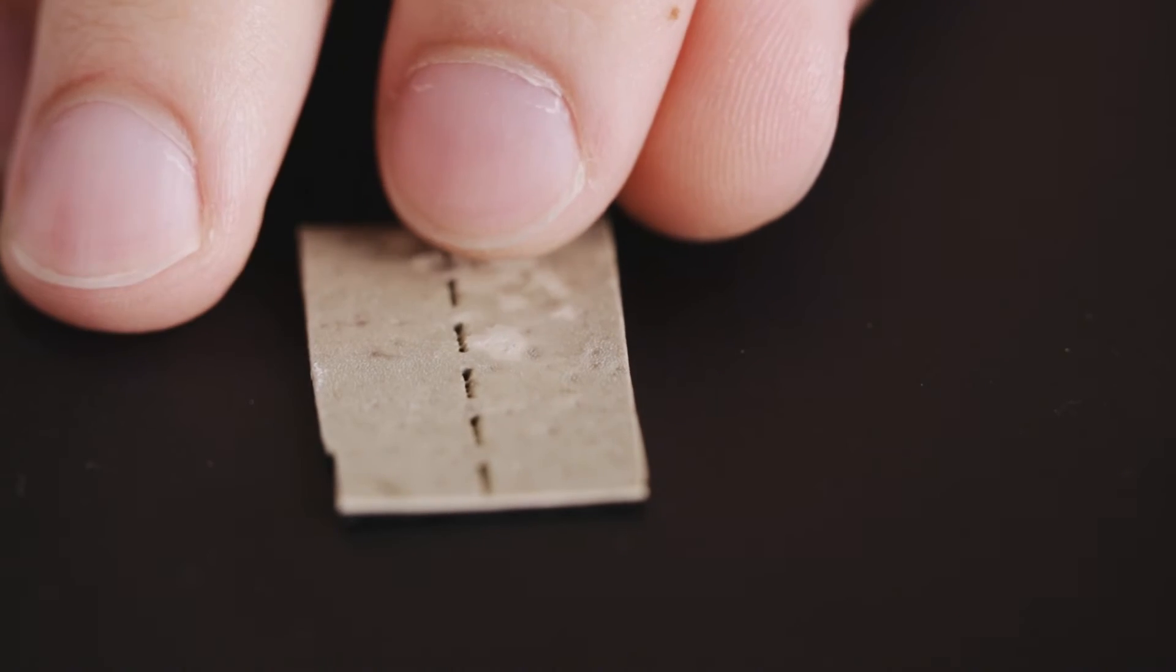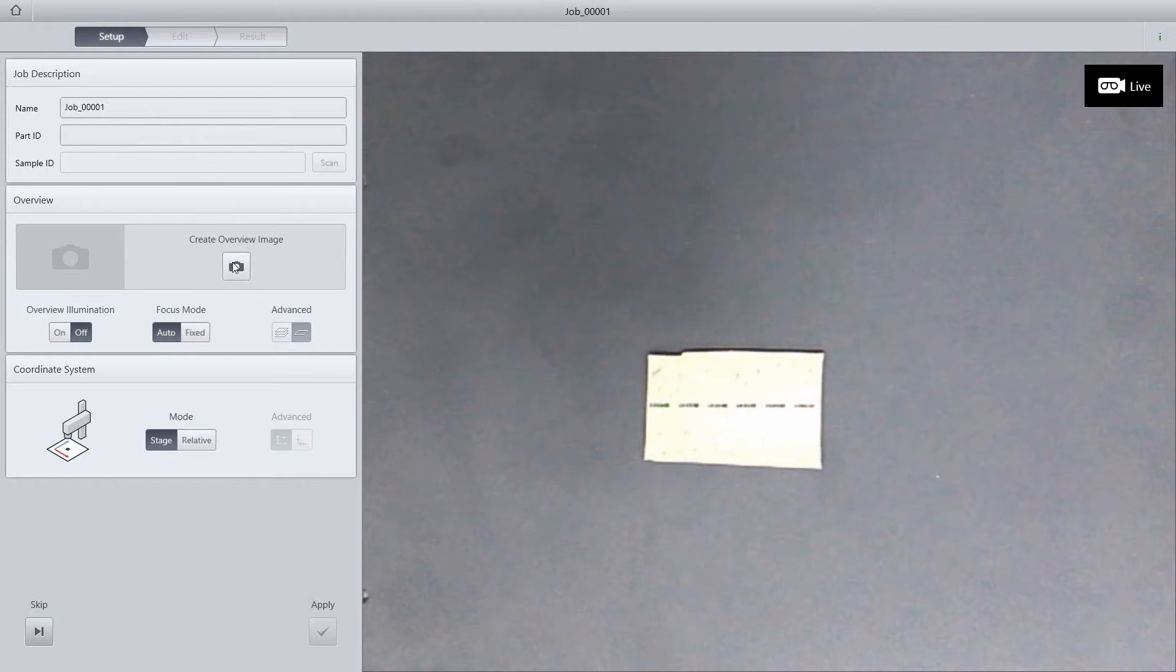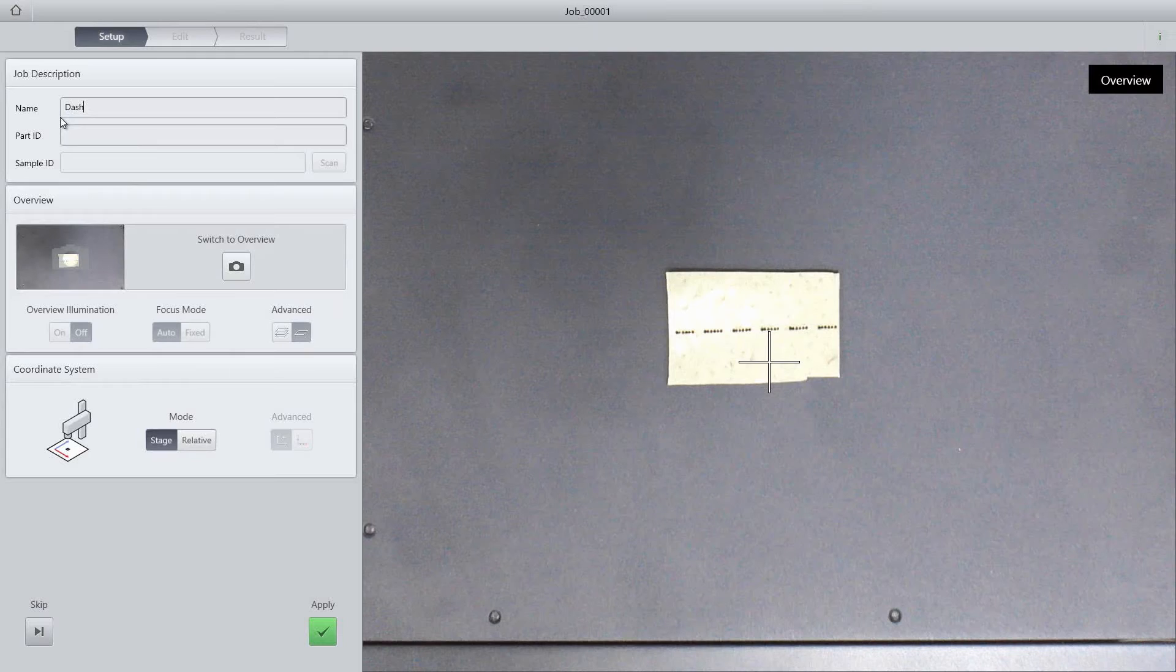Just put your sample on the stage. The overview camera shows you exactly where you are at any given point, even when examining larger parts.